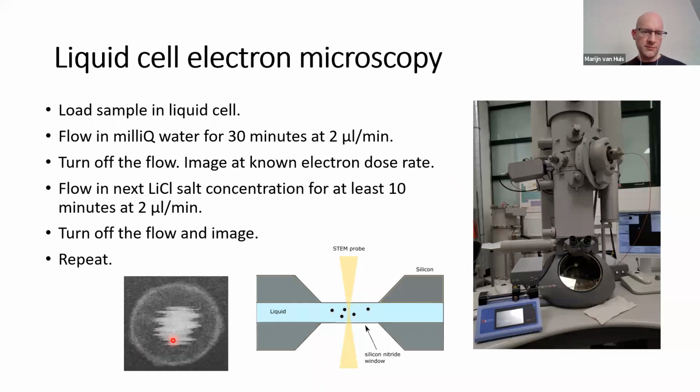So this is then what you see when you record the STEM image. So we do everything with STEM, because simply it gives the best signal to noise ratio when you work with liquid cells. Now, of course, the particle, as I mentioned, is quite a large particle, like 400 nanometers, but it even moves so fast that you cannot image it fast enough. So you get this stripy pattern because of the STEM imaging from left to right. But nonetheless, you get an idea of the area that is accessible by the core within that fixed shell. The point here is that this is a 2D projection, so we also have to take into account that the real motion is in 3D.